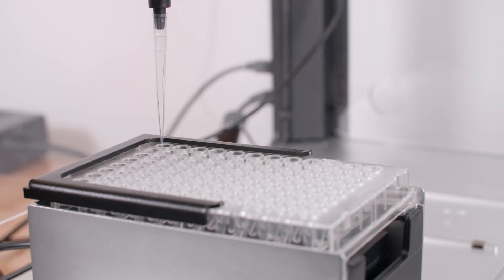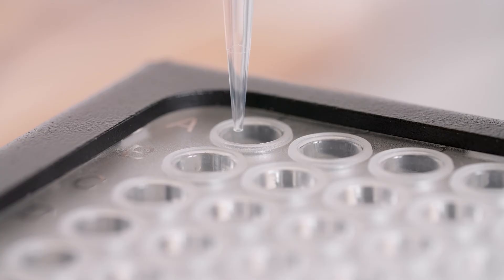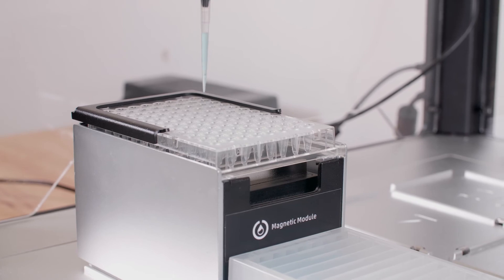Calibrating your magnetic module is similar to any other OT2 labware setup. You simply adjust the robot's positioning and save it for the first well in a piece of labware, and then it knows where all the other wells are.